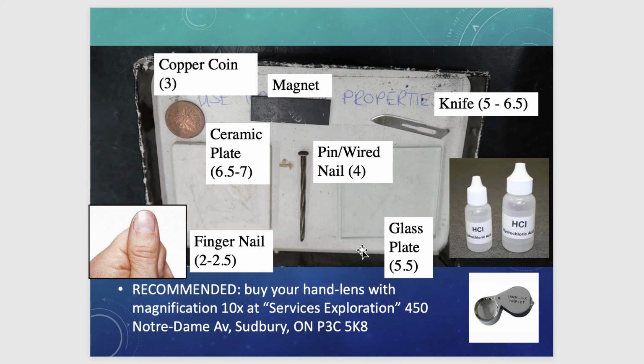We have also other tools. This one is the acid. This is hydrochloric acid. It's not pure, just a small percentage, less than 10% solution of HCl. That is sufficient to react with the carbonates in either a mineral or a rock. If you have calcite, usually it gives a vivid effervescence. Instead, if it's something else like dolomite, often dolomite doesn't really fizz that much unless you pulverize it and heat up the sample. So that is a good way to distinguish things.